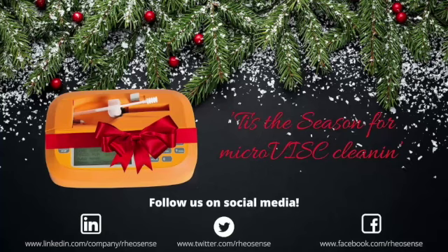What is the best way to maintain chips? And as a follow-up, because there was another question, what are the service requirements for microVISCs and microVISC chips? So it's an all-encompassing question.